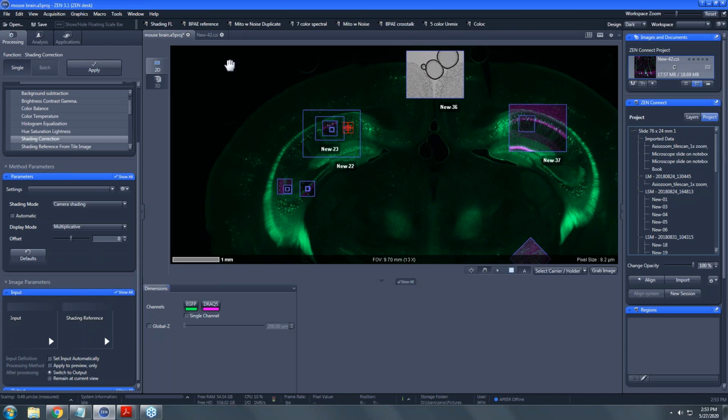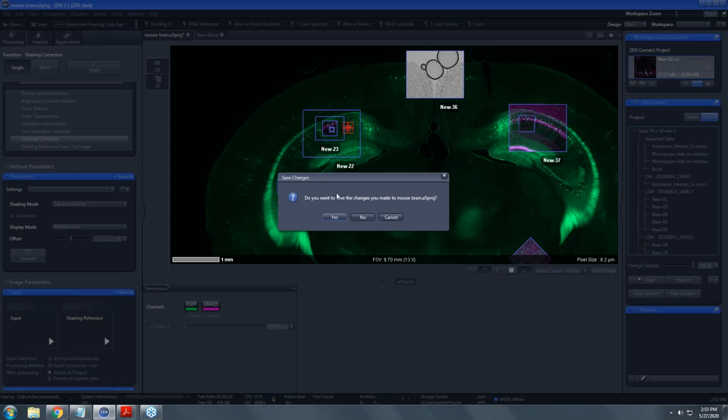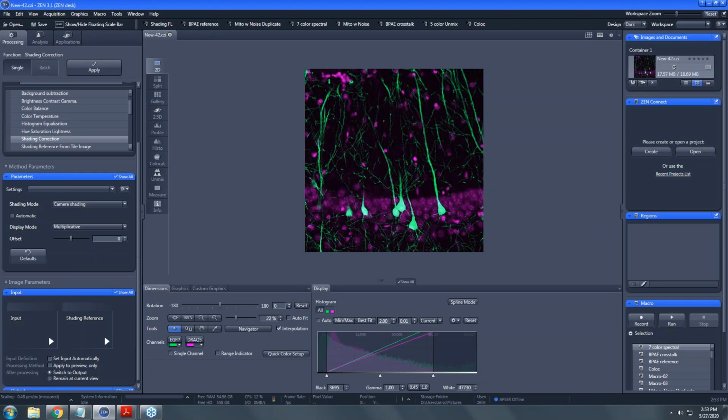Good. We're going to do some image analysis then. And more specifically, we're going to do some machine learning image analysis. So if you were here last week, last Explore Zen, we stepped through the basic image analysis. Nicole's going to take the mouse now and take us through a comparison between classical or basic image analysis and machine learning image analysis. And we're going to do a walkthrough of how this is done, what buttons are pressed in Zen. But we're also going to talk about the advantage of the machine learning.